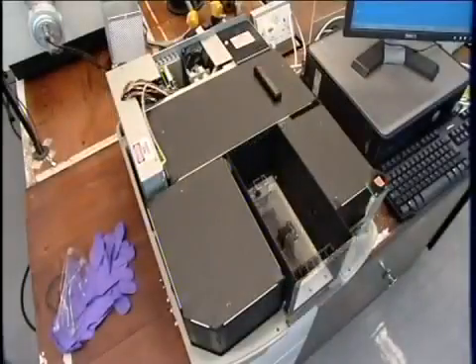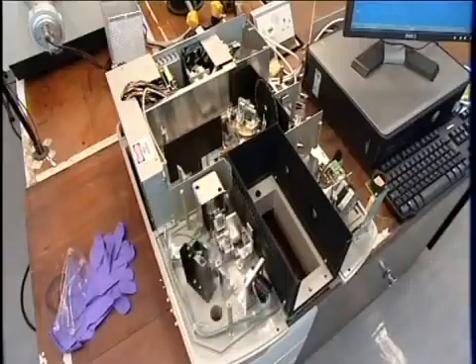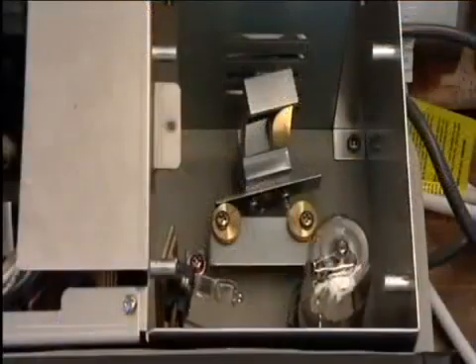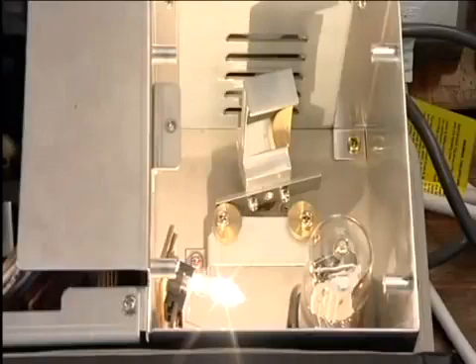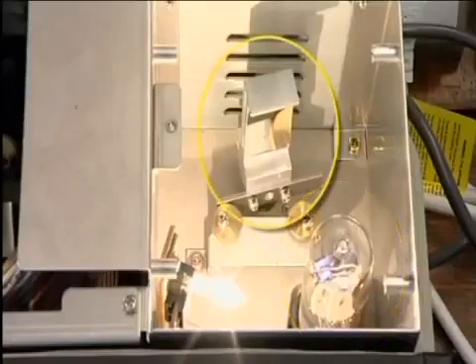Inside a UV visible spectrometer, there are usually two light sources, one giving out visible light and one ultraviolet. This one is a tungsten lamp, like a car headlamp bulb, for the visible region, and this deuterium lamp gives out ultraviolet. This mirror directs light from the appropriate source into the monochromator.